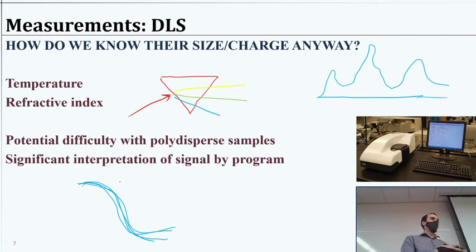So there's a lot of algorithms, a lot of computational stuff at play here, and not nearly as direct of a signal-to-answer ratio as we're used to in some other measurement techniques. So if you use an HPLC, for example, maybe you're using the mass detector or a UV detector and measuring exactly the electrons kicking out, which have exactly to do with the amount of light absorbed or something impacting the detector. In this case, there's a lot more steps in between. So I say that to add a caveat to these measurements, just to say that it's messier. We can't rely on it to the same level of precision that we might other techniques.